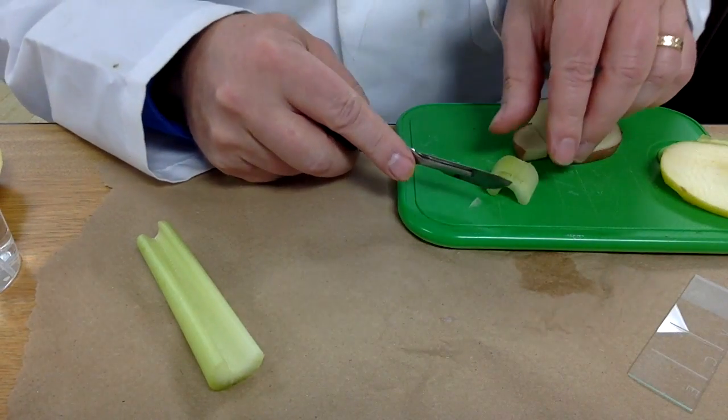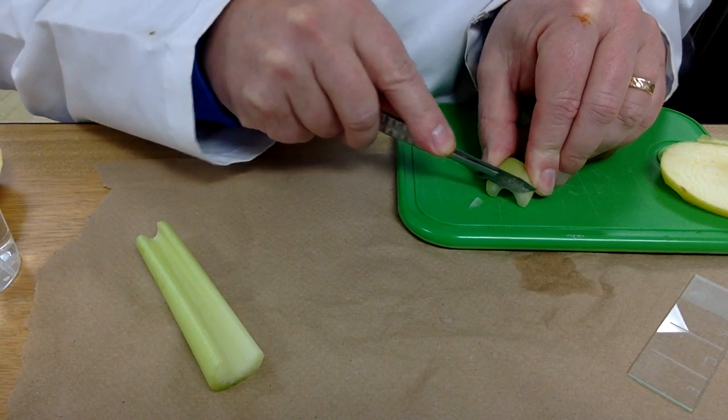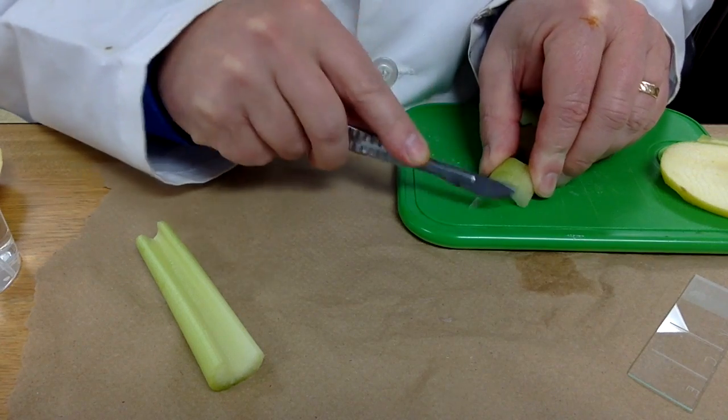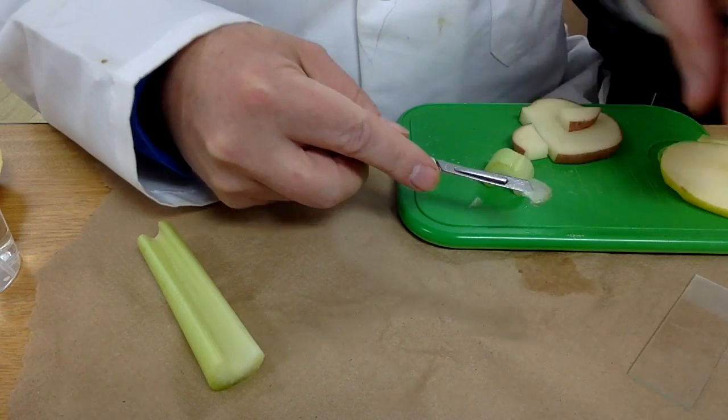I'll show you from this angle how to get a very thin cross section. That can be placed on the microscope slide.